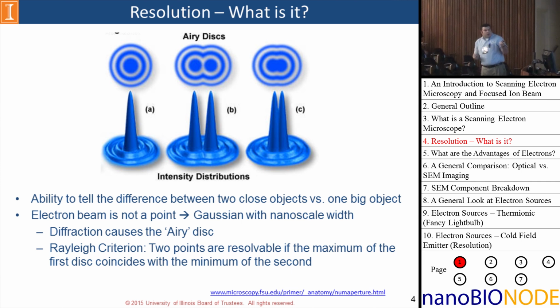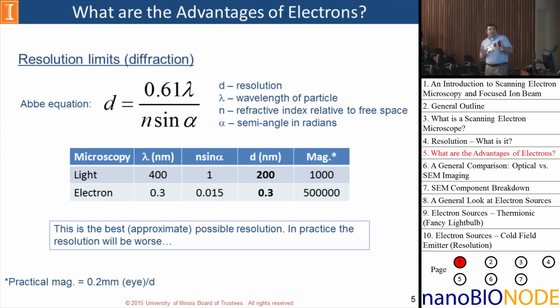All right, some numbers to throw out: some resolution limits based on just diffraction. I'm sure you've seen this equation before. Why do we want to do this compared to the main technique, optical microscopy? Optical is the one thing you're probably all very familiar with, right? You've used them all in secondary education, even high school.